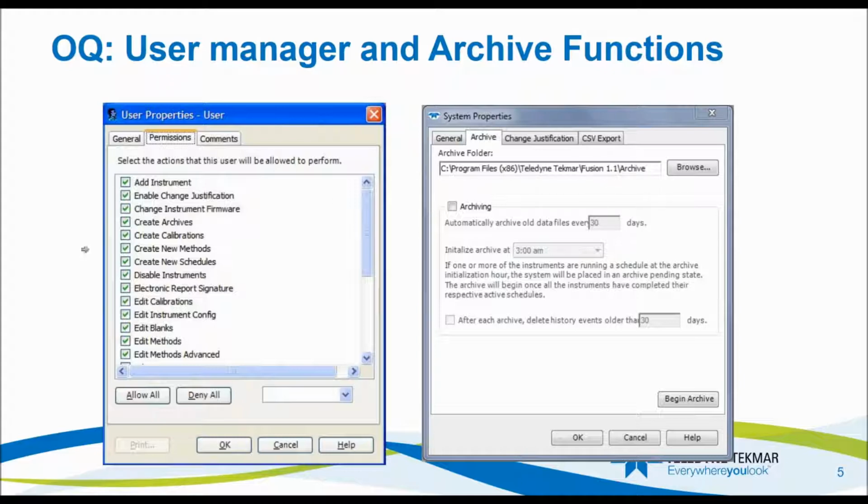Also, you can create permissions, which are like profiles for each analyst, and allow them to do certain functions within the software. For example, if you have somebody new that's perhaps an intern or something, you would uncheck a lot of these boxes and maybe they could only start a schedule. But a more advanced user is able to do everything. They can edit methods, create new methods, edit blanks, that kind of thing.